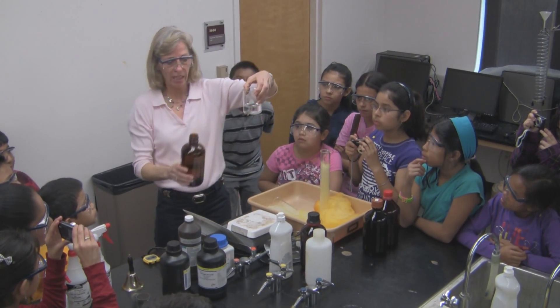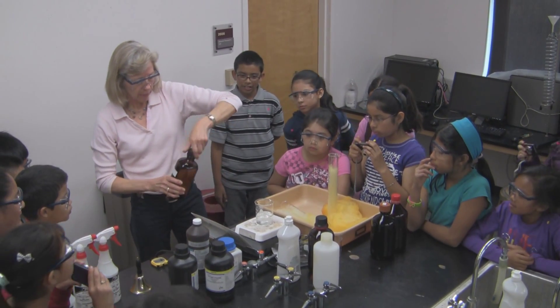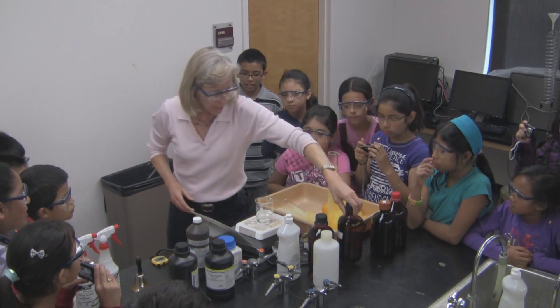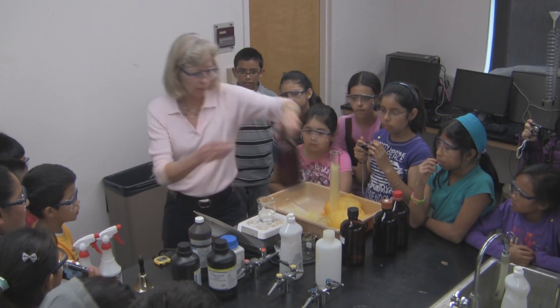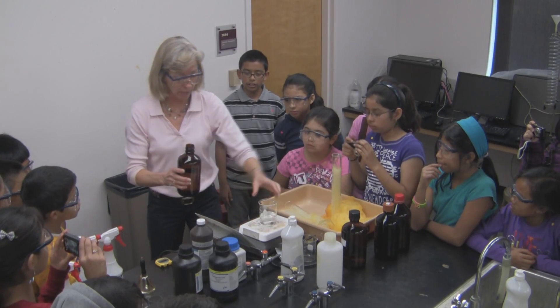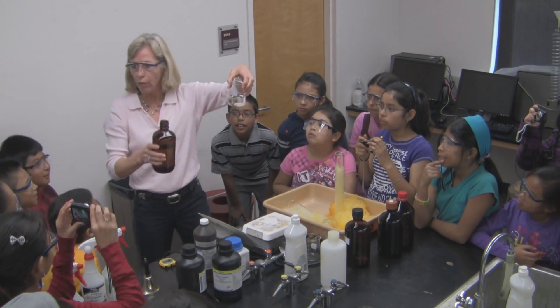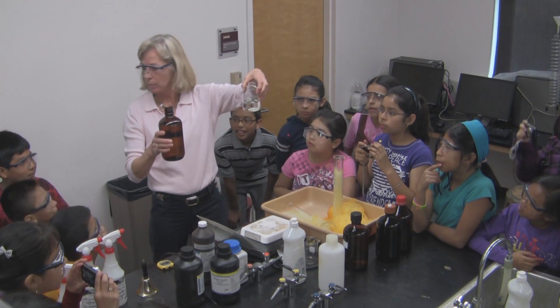Do you see anything happening yet? No. We'll stir that up. Now we're adding a little bit of acid, and inside here is a little bit of starch. What do you know starch is? Have they done any experiments with starch? How far do I go? Same amount — 150.